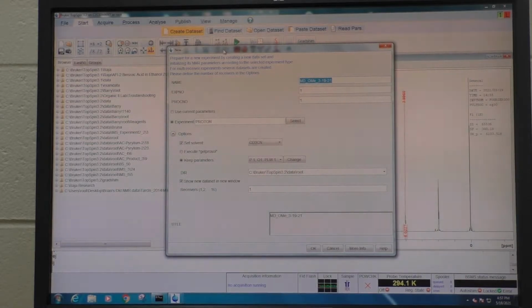I need to have a name for the sample. And it's really important to name the file in a way that you will remember it, perhaps something that corresponds to your notebook. So a notebook number and date are very useful to help you identify when something is there. Often your initials as well, so that it can be distinguished from other students' spectra. And so here, I'm going to put my initials, IAM, and then an underscore, and I'll call this unknown 6.